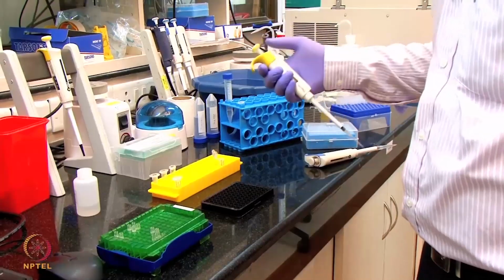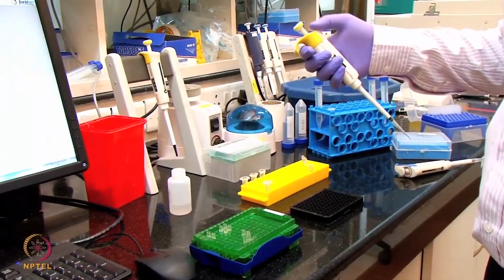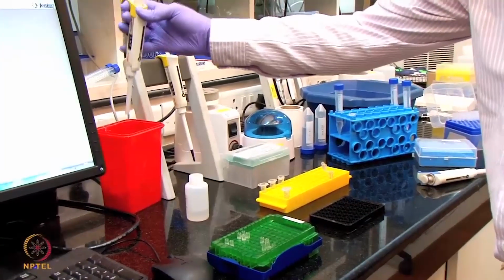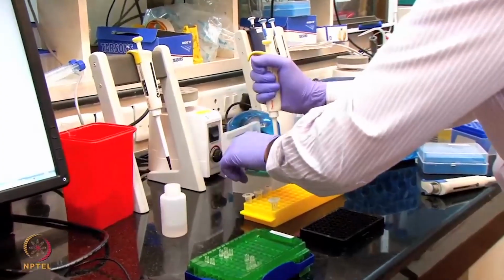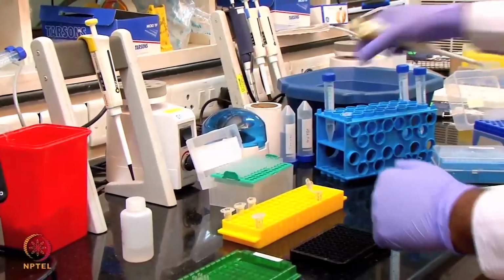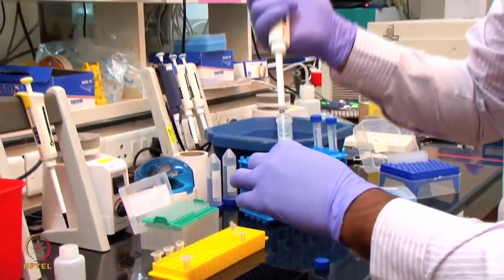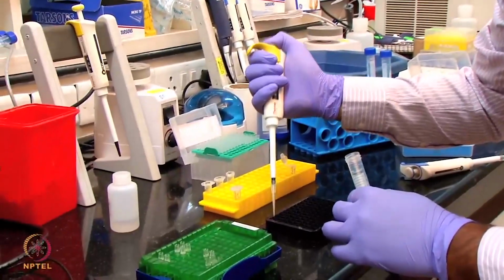Now I am going to demonstrate how we immobilize the anti-apolipoprotein onto the streptavidin sensor. I am taking 200 microliter of the 1x PBS buffer. This is prepared. I am going to add 200 microliter to each well of the 96 well plate.